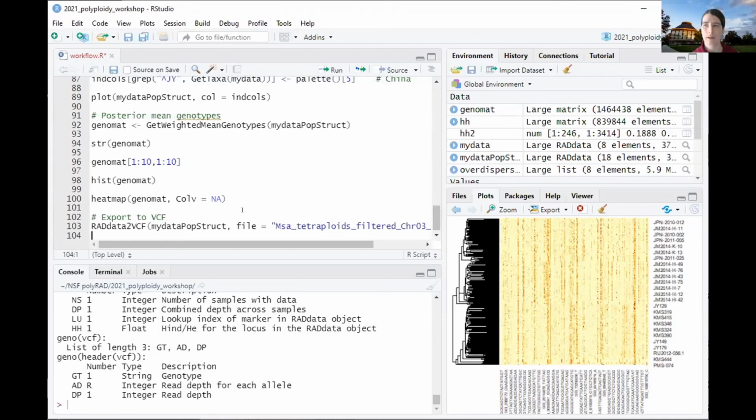Yeah, right now polyRAD won't do that. It would kind of be each one in isolation. But I know what you mean, where you would want, especially with sample sizes like that, you would want to inform one from the other one. Yeah, maybe at some point I'll rework things to add that in, but right now it doesn't work that way. Okay, thank you.